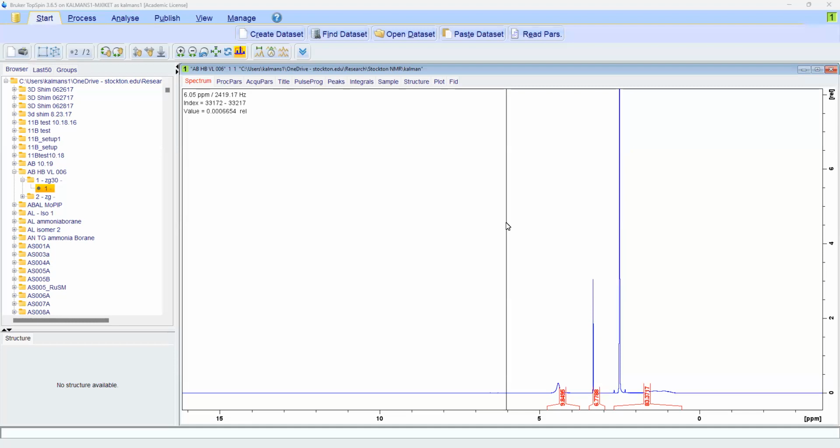And I should mention, there are other free NMR processing programs available. So if you're looking for a suggestion of whether something that you found is appropriate for our class, you can let me know. But most of the processing we're doing is generally pretty simple. Predominantly, we're just going to be picking peaks, so finding the chemical shifts, and then the integrations.